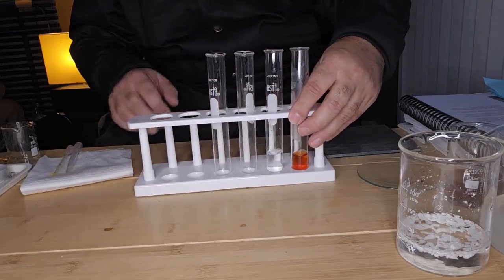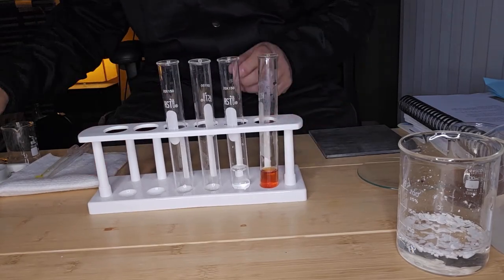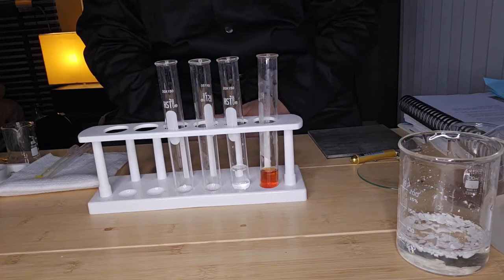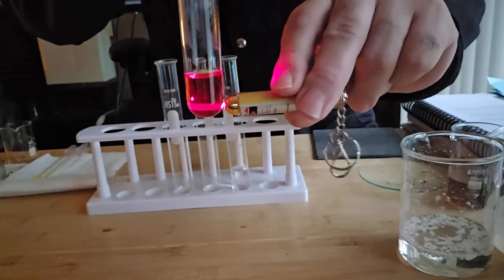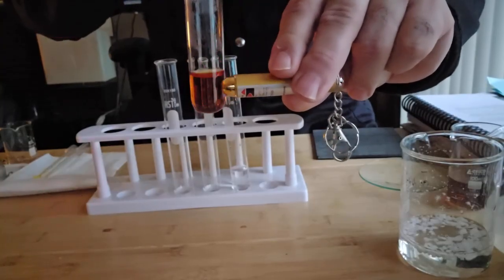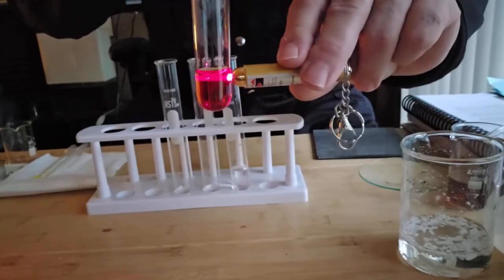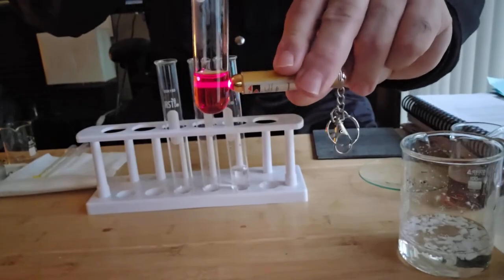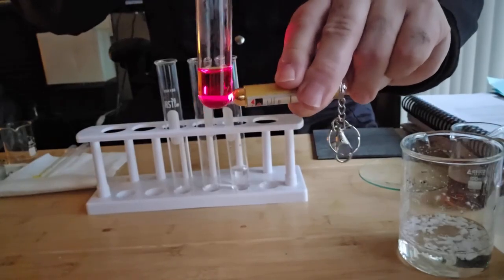One way to be able to tell is to shine a laser through the solution. Let's do that now. I'm going to turn off the lights and shine a laser through the test tube and observe what happens. I'm shining my laser through the sol solution, and you can clearly see the beam of the laser traveling through the solution.